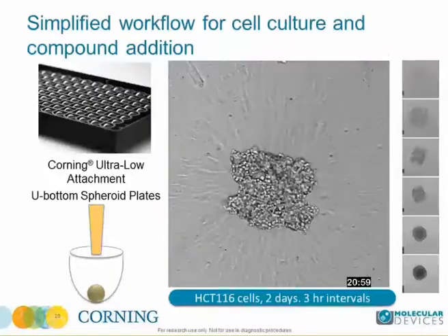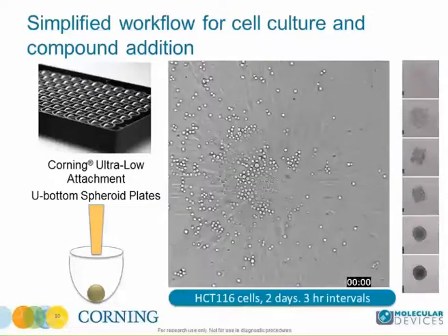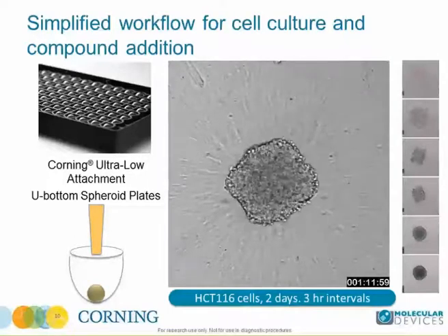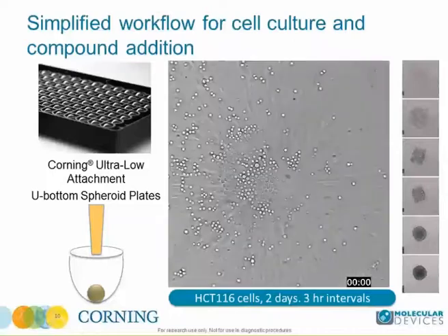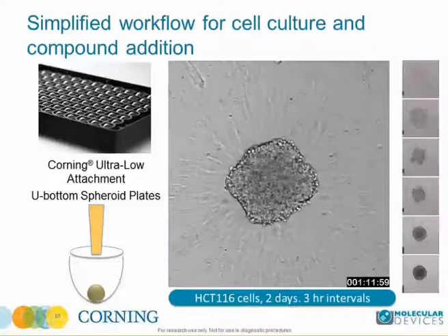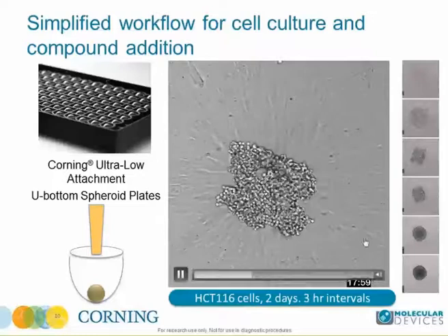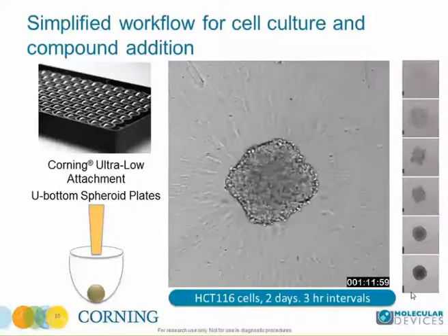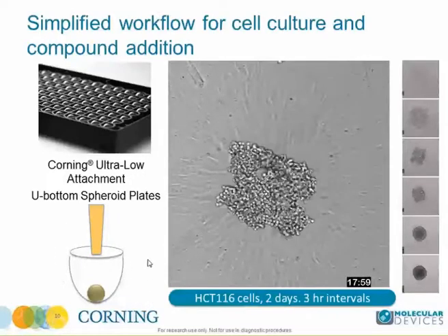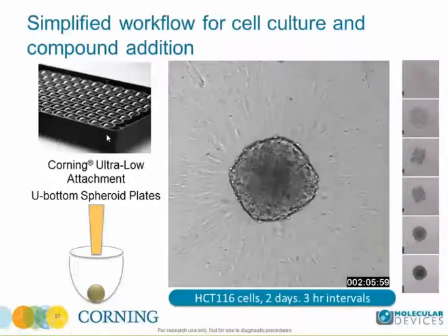We've developed a very simplified workflow for culture and compound addition. You can add your cells to these wells as you would normally, and after 1 or 2 days, you've got nice spheroids formed, and there's a time-lapse movie showing that. And there's a panel on the right showing the time-lapse data as a montage. And then what's nice is you can just, and Oksana will show you, add your dyes to these wells and do your experiment.